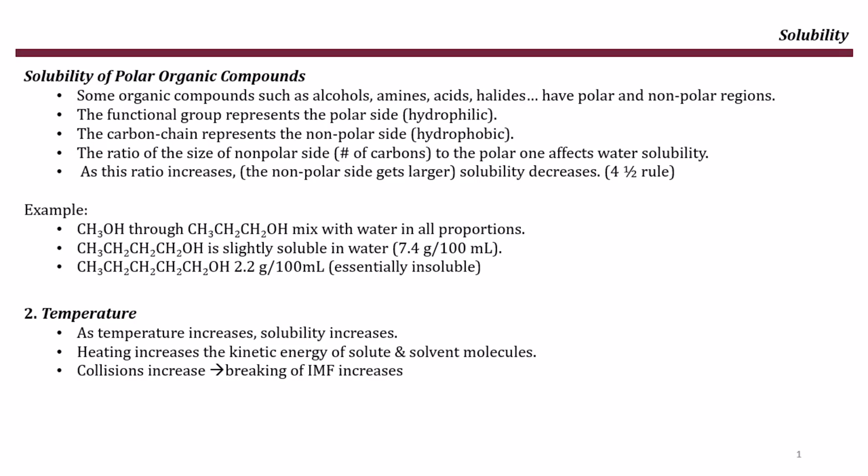The second important factor that affects solubility is temperature. As temperature increases, solubility usually increases. Heating increases the kinetic energy of both solute and solvent molecules, which makes collisions more frequent and stronger. These collisions can overcome intermolecular forces, leading to increased solubility. A common mistake students make is assuming that if a compound dissolves in water when hot, it must also be soluble at room temperature. This is not always the case. Solubility must always be considered at the specific temperature you are working with.